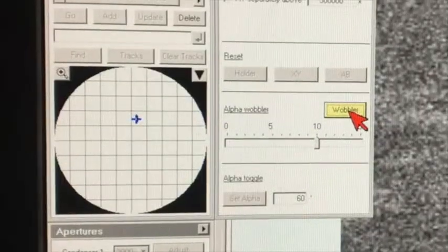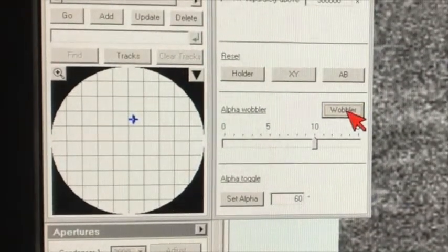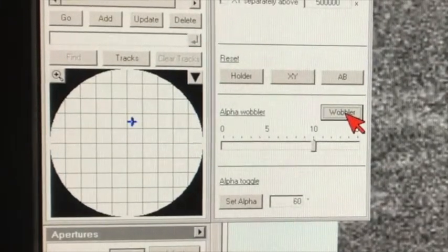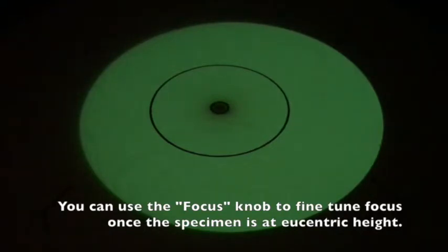We know that the specimen is at its right eccentric height. To deactivate the wobbler, just click on the wobbler button and the stage now stops rocking. When the specimen is set at the right eccentric height and the focus is set correctly, the contrast of the specimen is minimized. We're actually looking at part of the specimen, but the contrast is terrible and we cannot see the microstructural features.